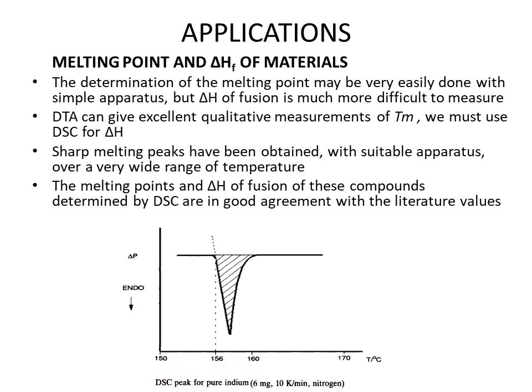So you can see there is a curve, an endothermic process, and this is the temperature at which the indium starts melting. The melting point and enthalpy of fusion of these compounds, determined by using a DSC apparatus, are in good agreement with the literature values. This means the values of enthalpy of fusion calculated by the DSC method are very reliable.